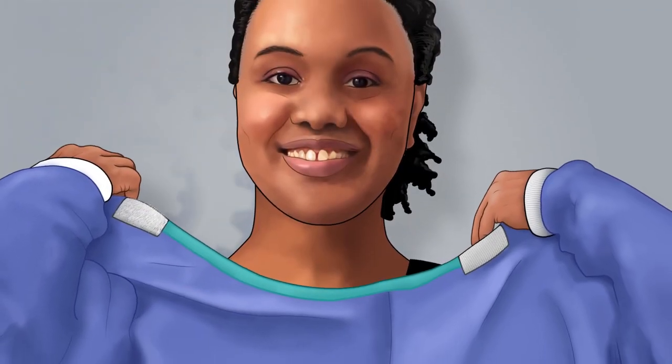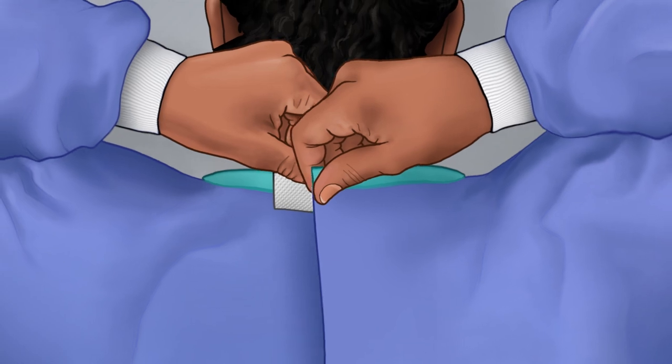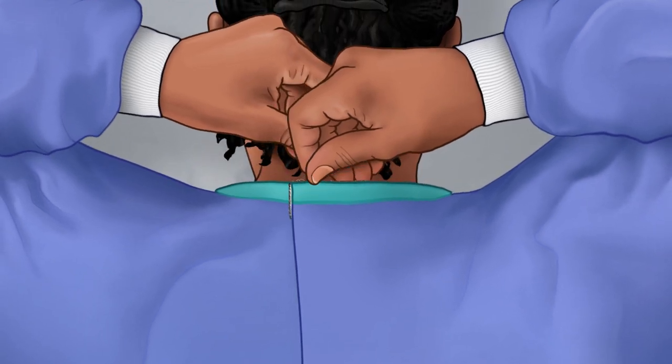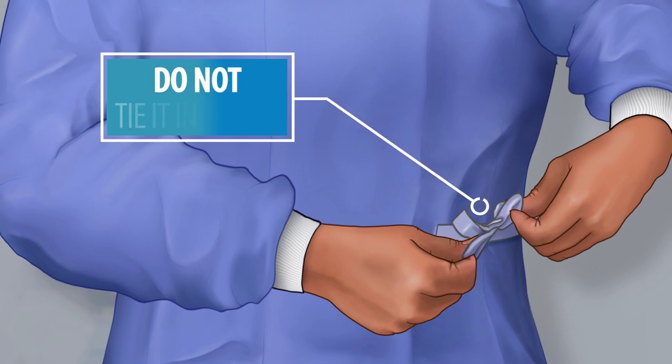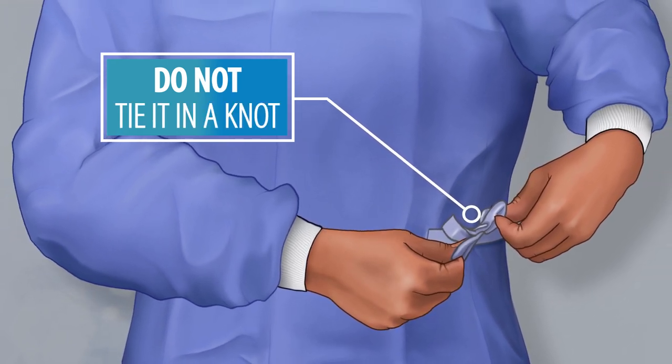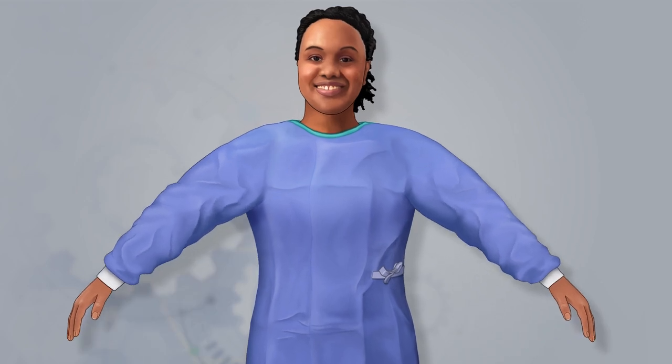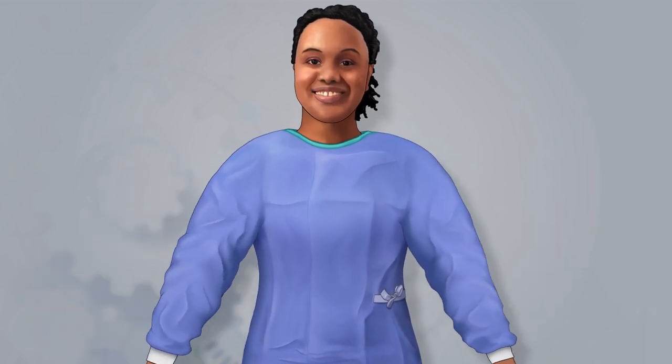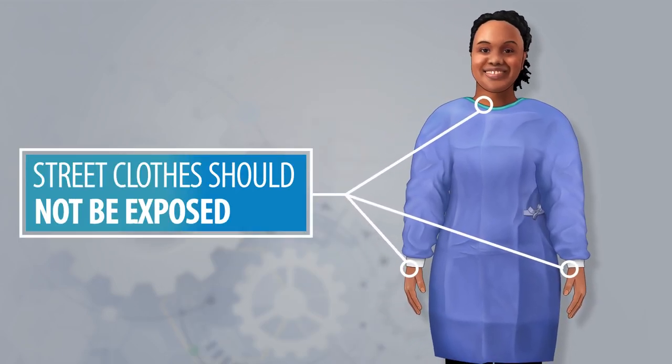Next, pull on the gown, fastening it securely behind your neck and back or side. Do not tie it in a knot or fasten it so tightly that you cannot easily remove it later. Make sure the gown fits well to allow for easy movement. Street clothing should not be exposed.